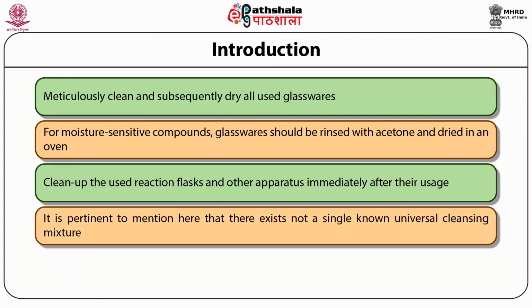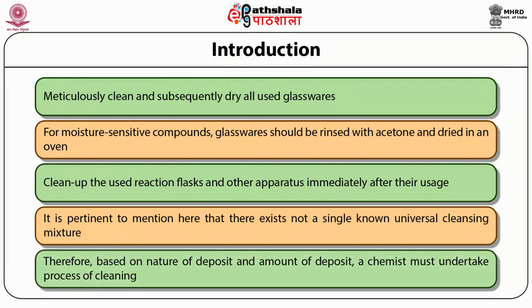It is pertinent to mention here that there exists not a single known universal cleansing mixture. Therefore, based on the nature of the deposit and amount of the deposit, a chemist must undertake the process of cleaning accordingly in a systematic manner rather than adopting a haphazard style.